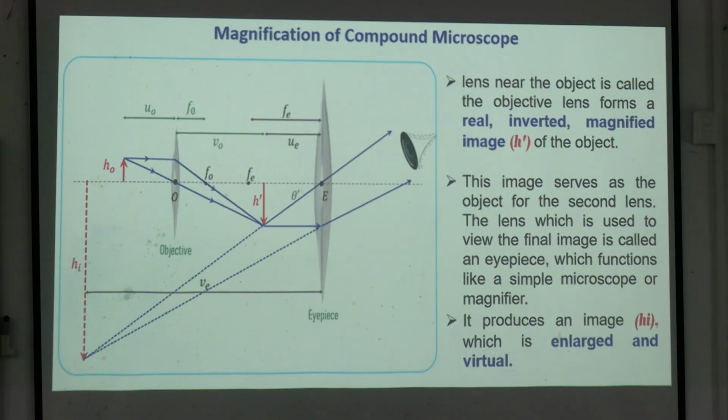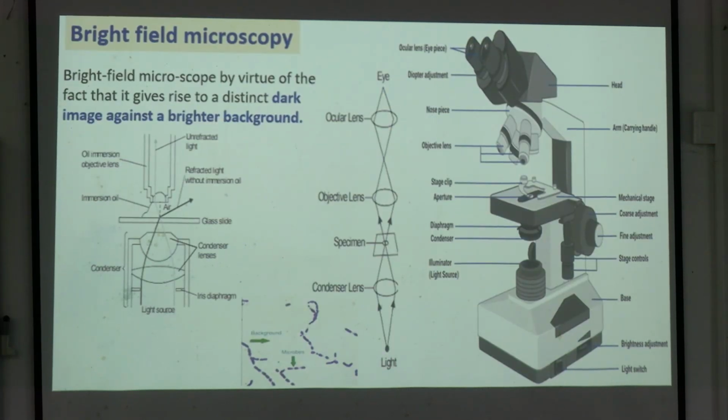Now the thing is about bright field microscopy. It is a part of light microscopy that we have in our lab. Basically the field is bright, and the object is dark, because we are staining the object to make it dark, to make it a little bit contrasted, right?